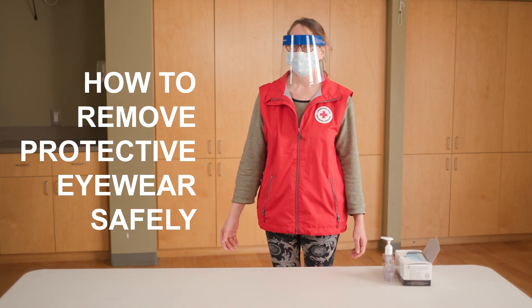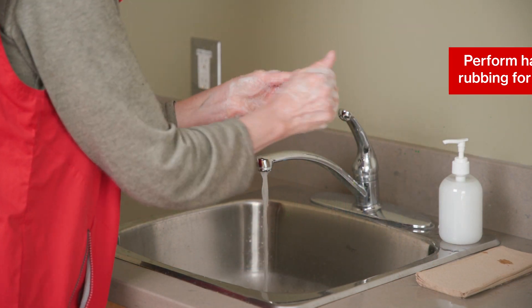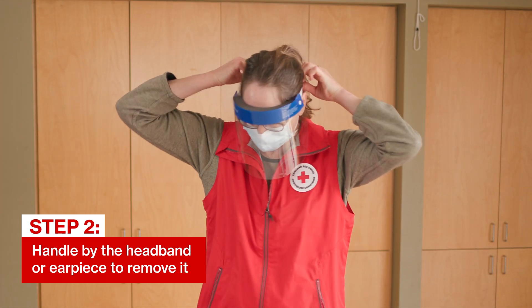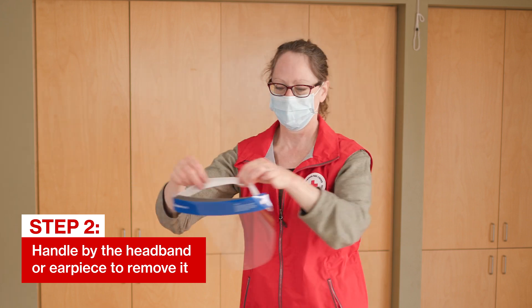It's important to remove your protective eyewear safely to avoid contamination. First, perform hand hygiene with soap and water or an alcohol-based hand rub. Handle only the strap, headband, or earpiece to remove it. Treat the outside of the eyewear as contaminated.